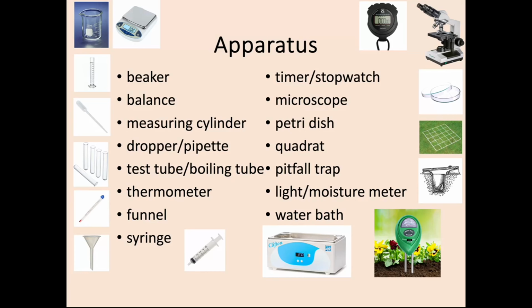These days, there's more modern devices that can maintain temperature, like thermotubes, for example. So water baths are a slightly older and less efficient way to do that, but that is the one that the SQA want you to know about for your exam. So a water bath is there for maintaining the temperature of solutions. Okay, it's good if you've got a question that asks about how would you modify this to ensure that the temperature is kept the same throughout. You would say use a water bath.